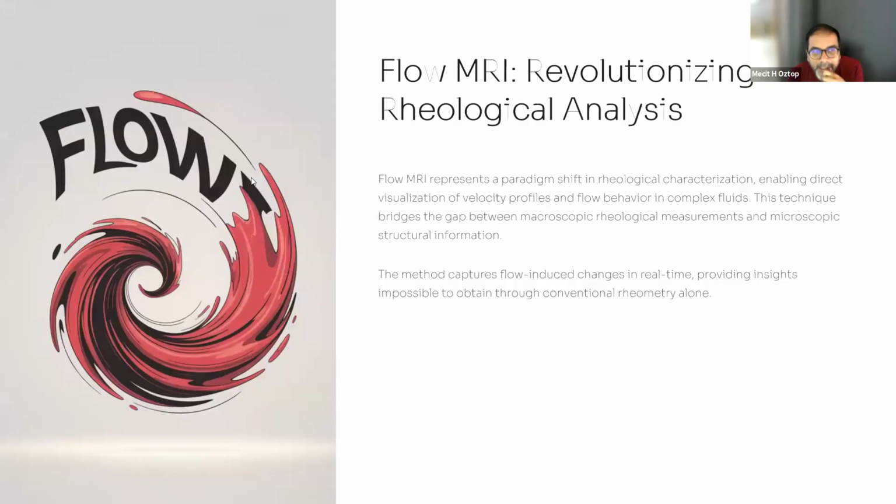Okay, well, flow MRI, in fact, has been studied for a long time, but it is really a shift in rheological characterization. Normally in the courses, we show our students the hypothetical flow images that is seen in a pipe, the velocity profiles in a pipe, but with MRI, in fact, we can really obtain these velocity profiles.